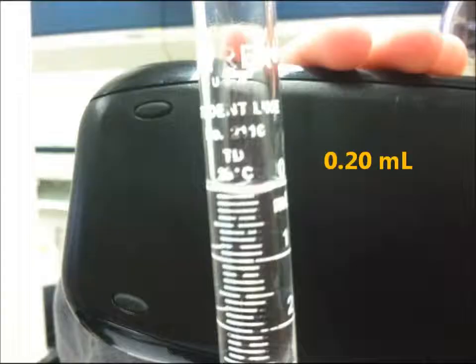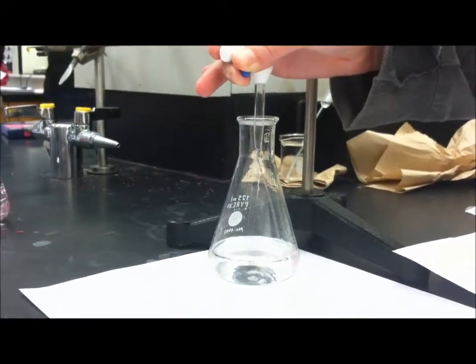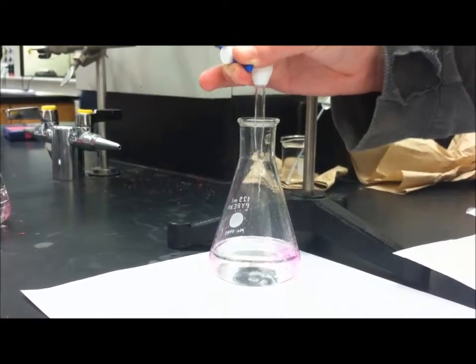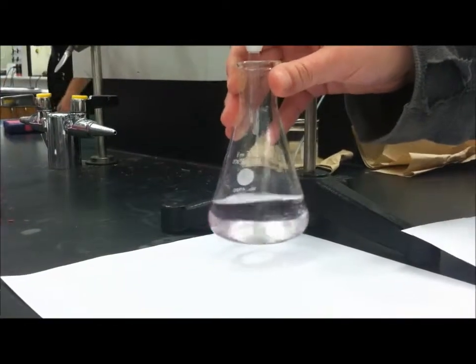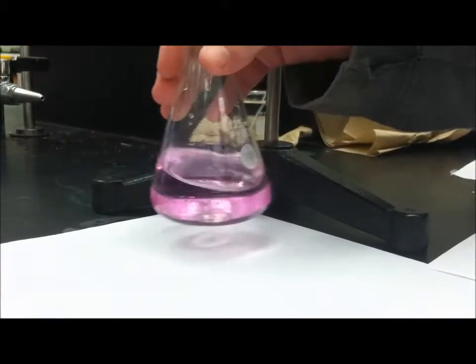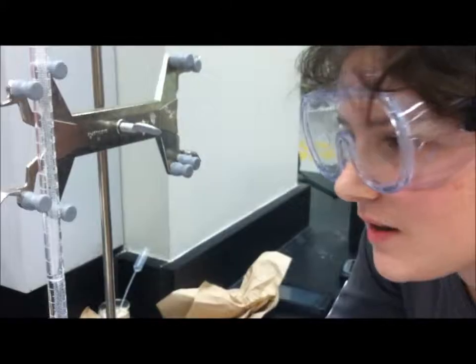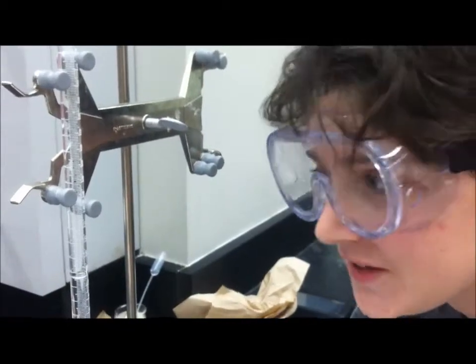So the initial volume in the burette appears to be about 0.2 milliliters. I am adding sodium hydroxide to the flask until it turns pink consistently. There's a little bit of pink, and here it's pretty pink, so I'm stirring it up to see if it stays pink. Now it has stayed pink, so it's probably about at the equivalence point, and the equivalence point appears to be about 44.55 milliliters.